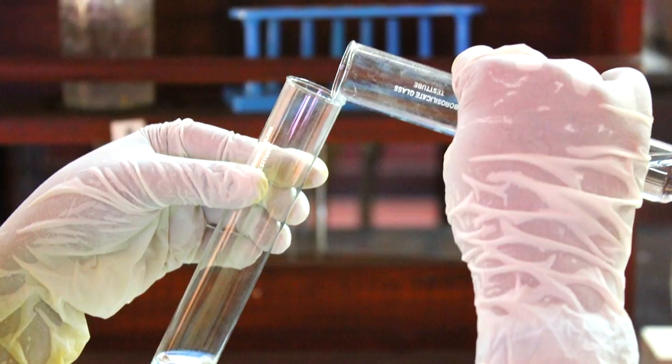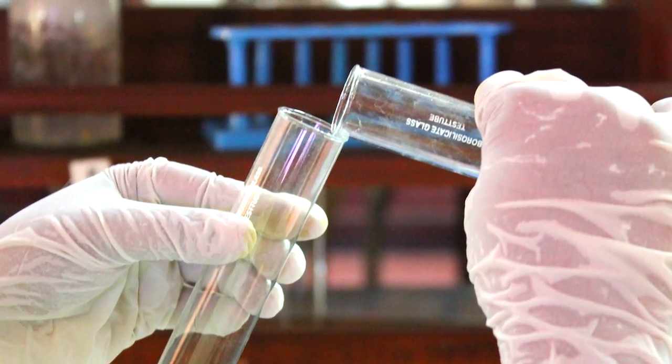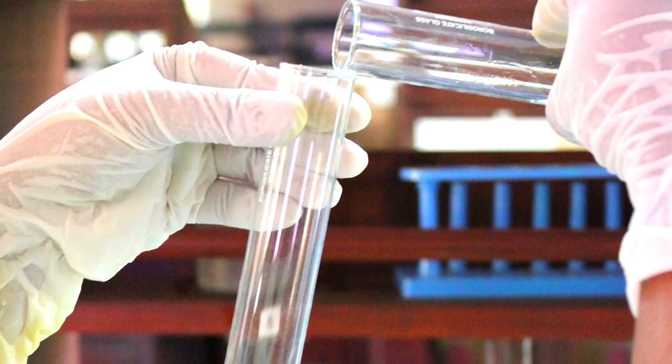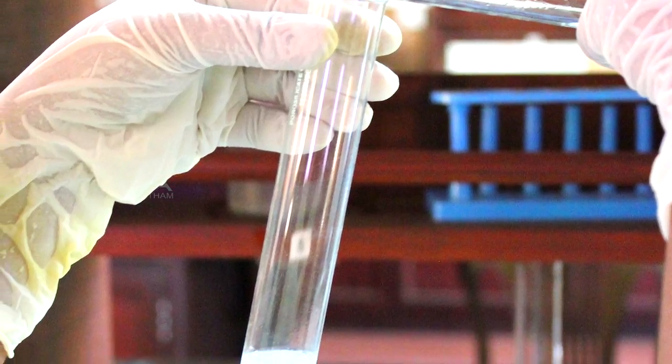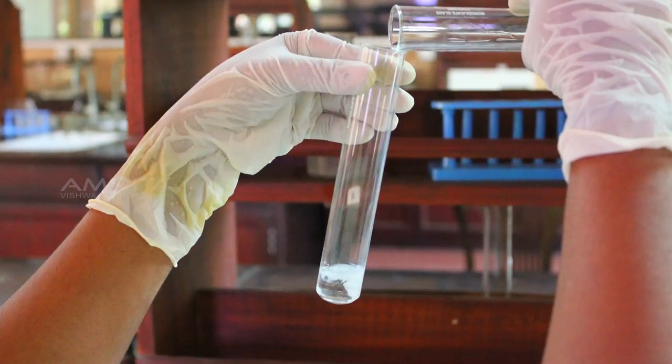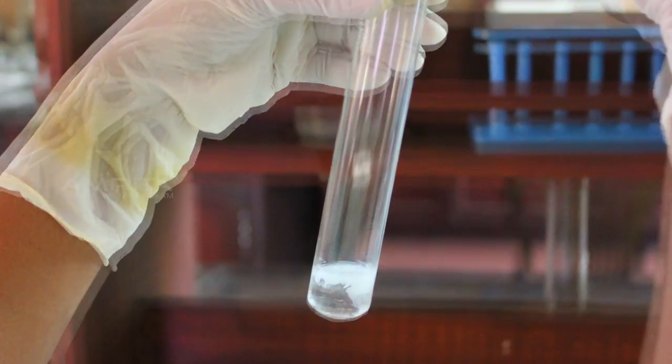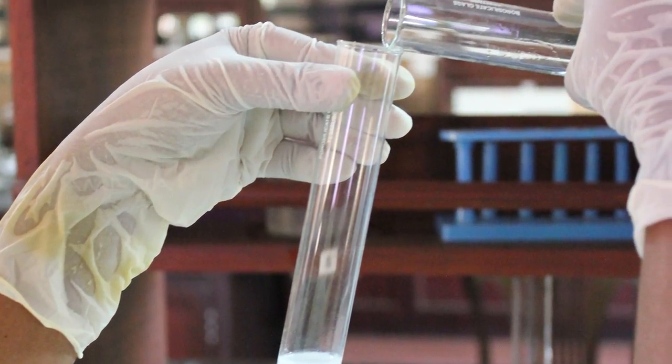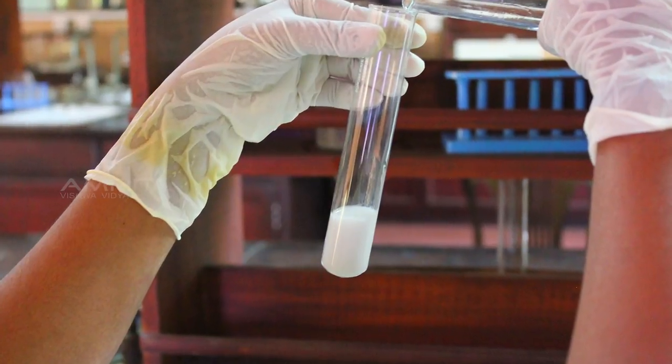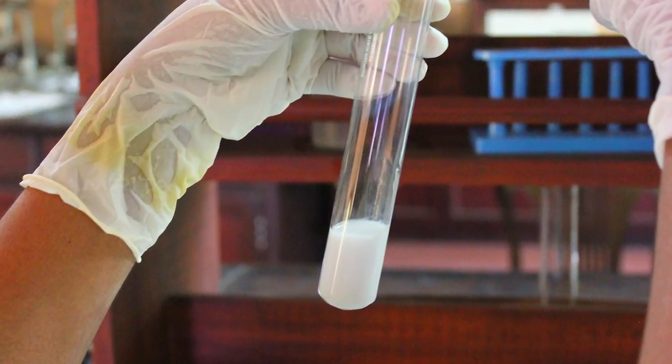Pour the barium chloride solution into the boiling tube containing sodium sulphate solution. On adding, a white precipitate of barium sulphate is formed in the boiling tube. This confirms the presence of sulphate ions in the solution.